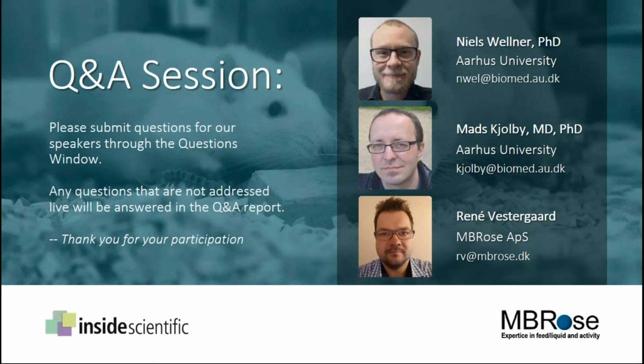You had presented a slide where you showed 4 to 8 animals in a cage, but the question here is, what is the maximum number of animals that one can put in a cage to study group-housed ingestive behavior?